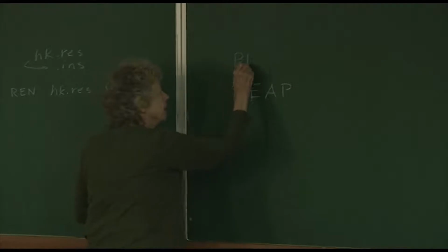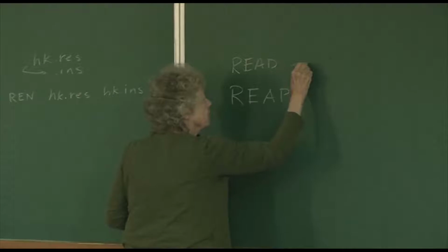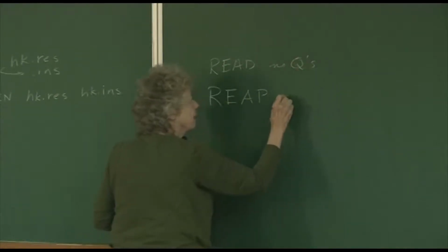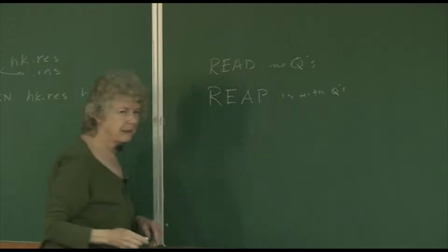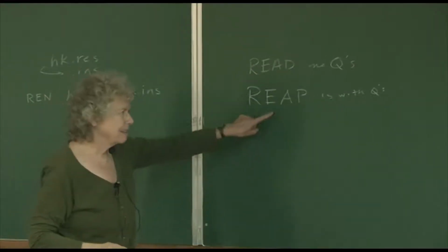So read is no Q's. And this is with Q's. Why? Because they appear after the end statement, right? So you're reading past the end of file.